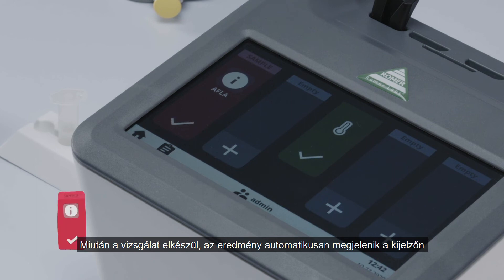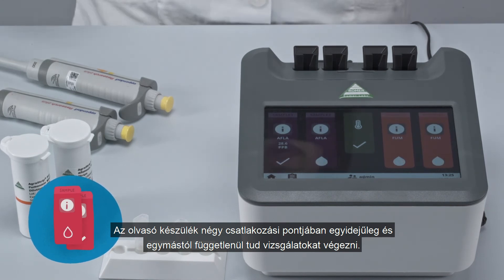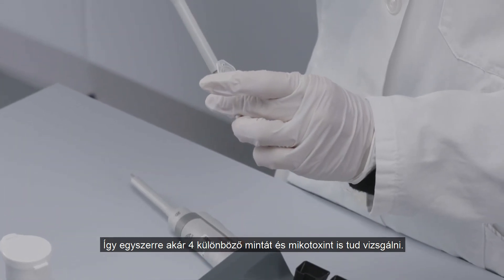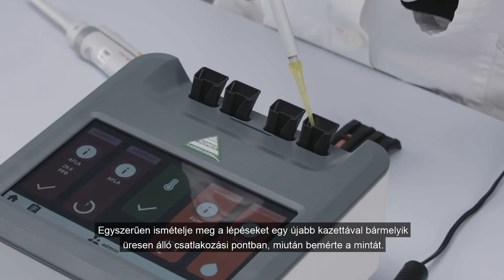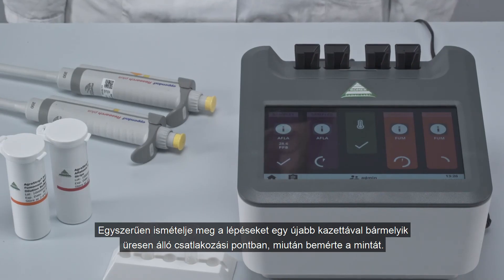After the assay concludes, the result will automatically be displayed on the screen. The four ports of the reader can run simultaneously and independently from each other. This allows for testing of up to four different samples and analytes at the same time. Simply repeat the procedure with a new cartridge in any available slot after adding the sample.